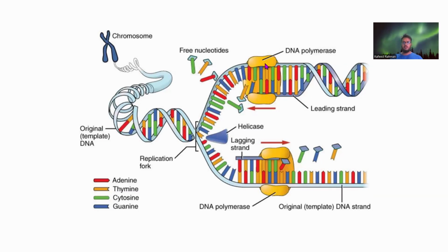If you have a single strand and you have this polymerase enzyme and you have some specific sequence which is called a primer present somewhere, then the DNA polymerase starts synthesizing from there using the complementary bases. You can see that from the single mother DNA, we will ultimately form two children DNA, right, which are both double-stranded. That is what is known as DNA replication. This process will also come in handy when we talk about Illumina sequencing.